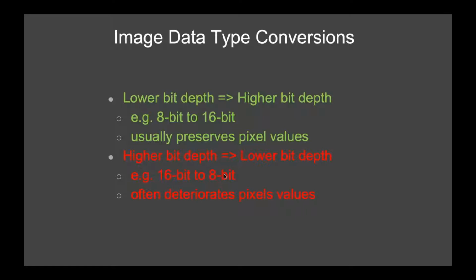If you really need to go to 8-bit, it's possible, but then you have to really think about that formula and apply the same formula to all images that have been acquired on the same microscope and with the same settings. So it's not strictly forbidden, but it's very risky and one can make a mistake here. So I would at all costs avoid that if it's not really, really needed.